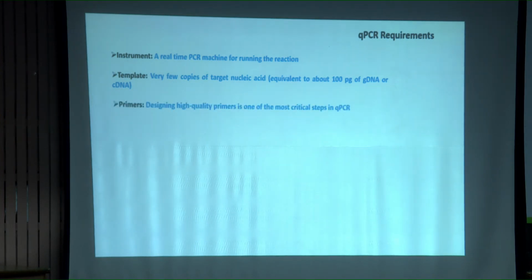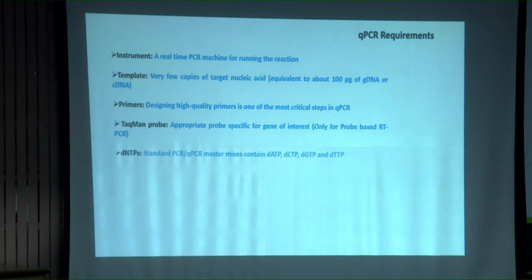And primers, of course. You are going to design these primers, and I believe there are classes in this course on how to design primers. You learn that, and qPCR primer designing is quite different from normal PCR primer designing. I think the team will teach you in the practicals. And of course, if you are opting for very sensitive and highly accurate detection, then you go for TaqMan probes, or you can go for even the routine and most popular, that is SYBR Green.